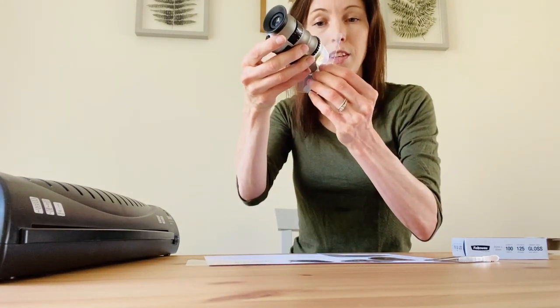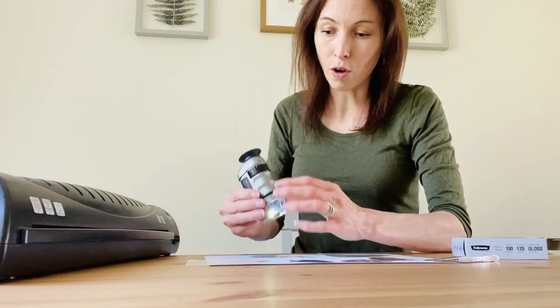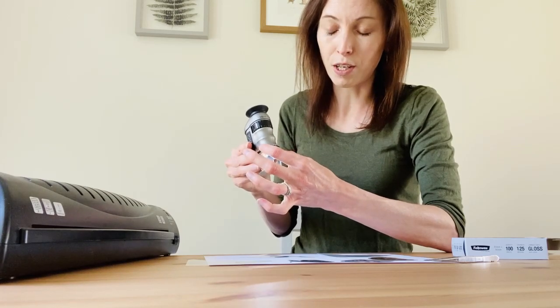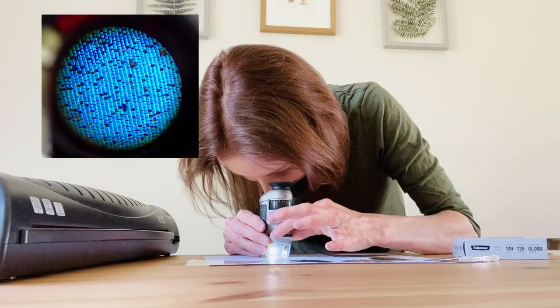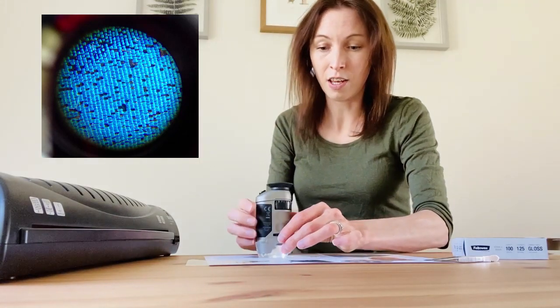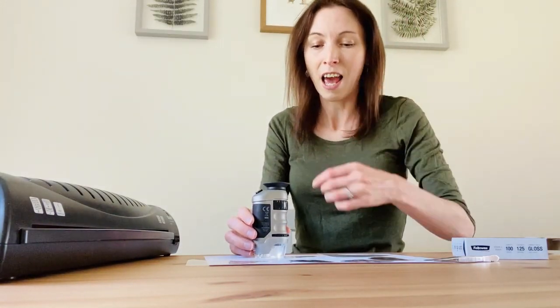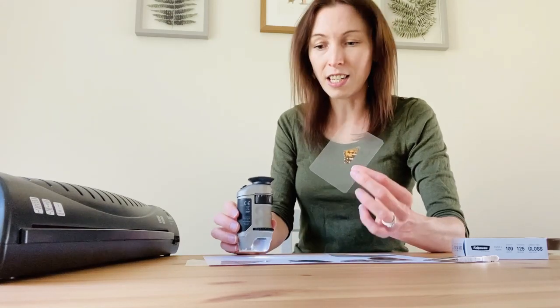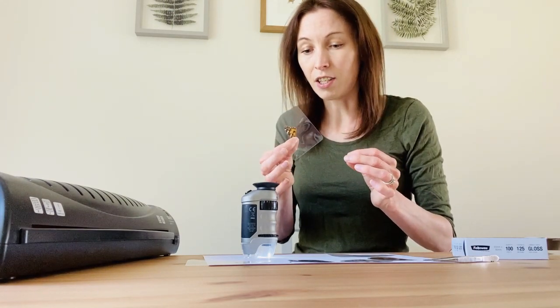You've got a couple of options for magnification at the top and a focus at the bottom, and then you just look through. Even though they're sort of children's microscopes — this one I think was about 14 pounds on Amazon — you can see some really interesting detail. With things like butterfly wings you can see the tiny little overlapping scales that make up the wing, the veins, and little tiny hairs. Really fascinating to see things through your microscope.